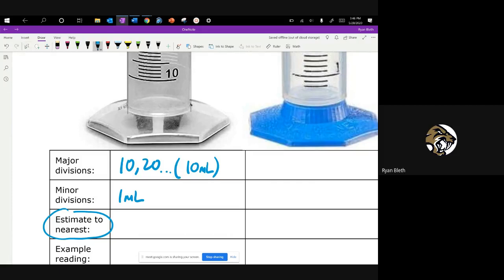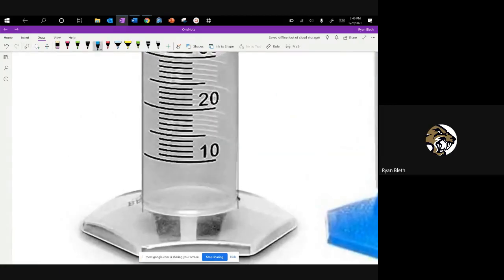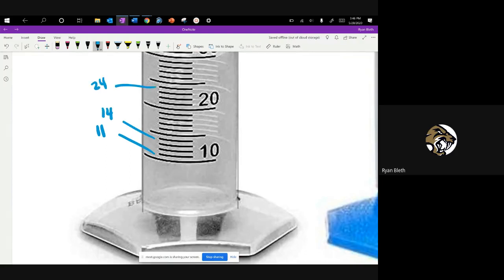So we want to estimate to the nearest 0.1 milliliter. On our device, since there are lines here — if I were to zoom in really closely, I would recognize that this line is 11 milliliters, this line is 14 milliliters, this line up here is 24 milliliters, et cetera. Between the different divisions given there, we can estimate one place further than that.